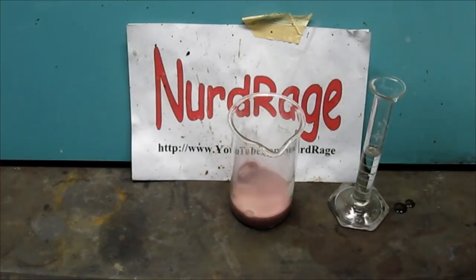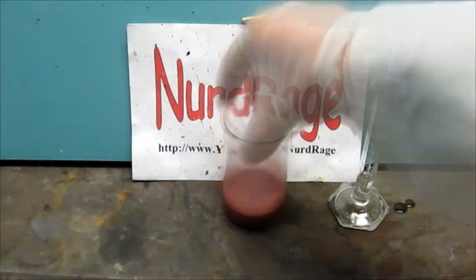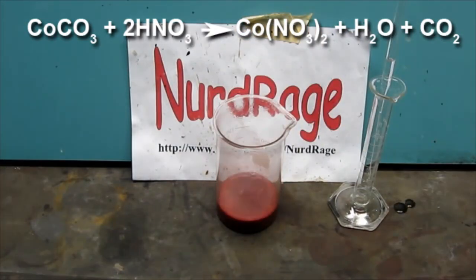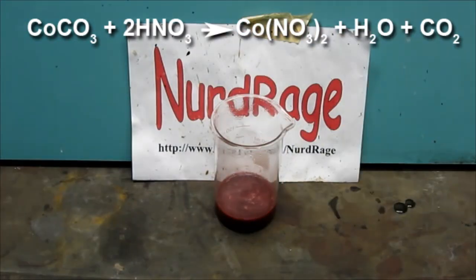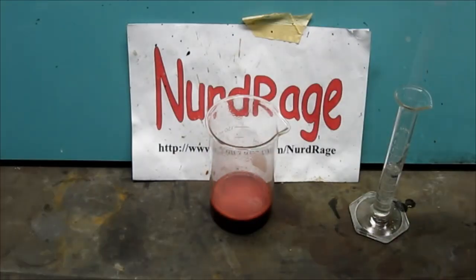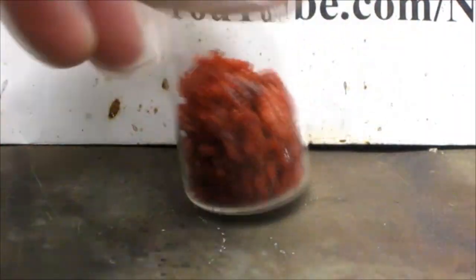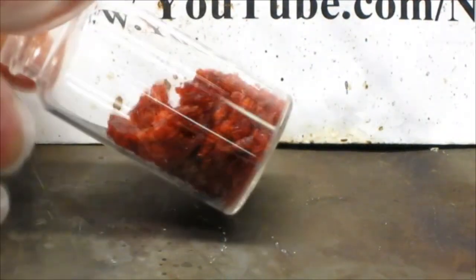Now get some concentrated nitric acid and just keep adding it until it stops fizzing. This is just a simple acid-base neutralization reaction that produces carbon dioxide. And that's all you need to do. Now you have a solution of cobalt nitrate. You can dry it to produce crystals of cobalt nitrate for storage.